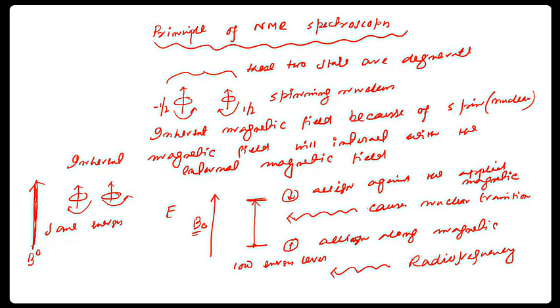So now I hope every student has visualized very nicely, in a story-like manner, the basic principle of resonance. And one thing we'll remember is that the external frequencies that we use are in the radio frequency region. Sometimes this is asked in MCQ manner.